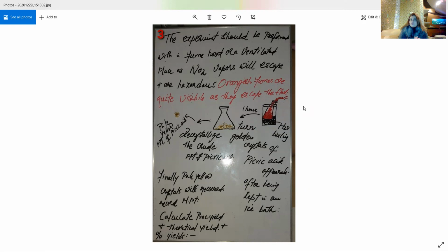This experiment should be performed in a fume hood. Yes, I have explained this: you have to see whether... yes, you have to be very patient when you are watching this.